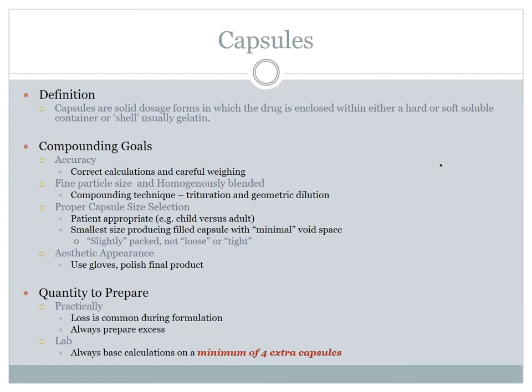Okay, so you get more drug in a happy 000, but you'd be choking to death, because a size 000 isn't even intended for human consumption. That capsule is so large, you choke to death. It's intended for a horse. It truly is a horse pill, a 000 capsule.